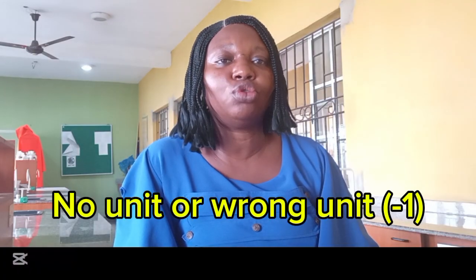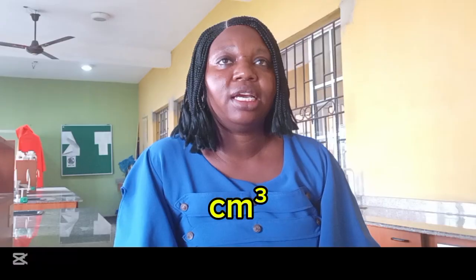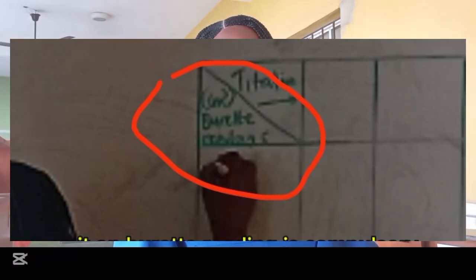The fourth thing that can make them deduct your mark is if you did not put unit on your table, or maybe you put a wrong unit. The unit on titration table is centimeter cube. Ensure you put it on your table, or you write it somewhere on your table that all burette readings are in centimeter cube. Very important.